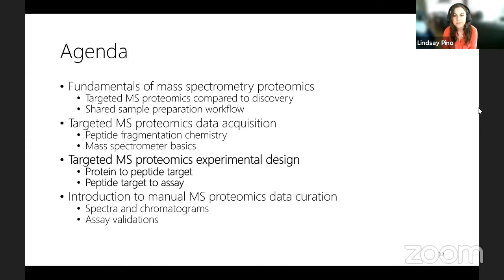Why? It has to do with how Skyline is processing the data, and there are definitely settings in Skyline to specify the parameters of your scans that will help Skyline process the data and pick the right peaks in your data. In the overview workflow I had shown at the beginning of the slides, I had a reference to a paper we had written a couple of years ago going over the Skyline ecosystem that walks through every step of exactly how Skyline processes the data.